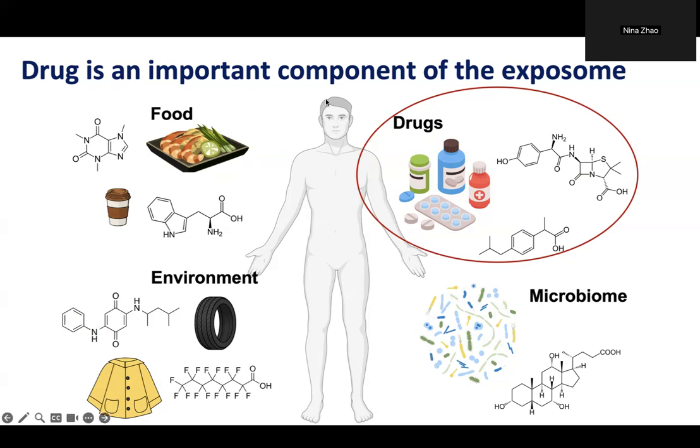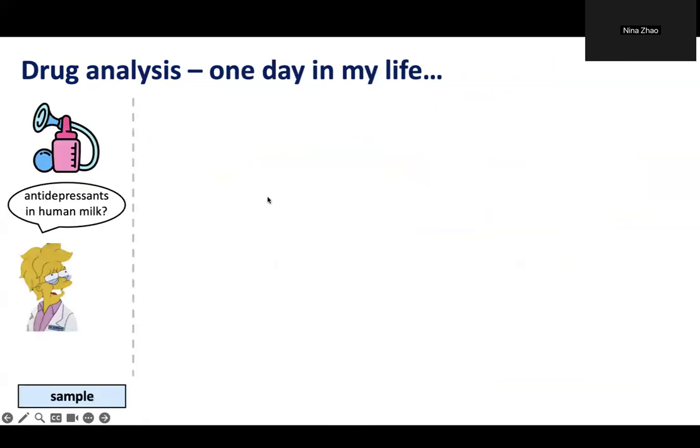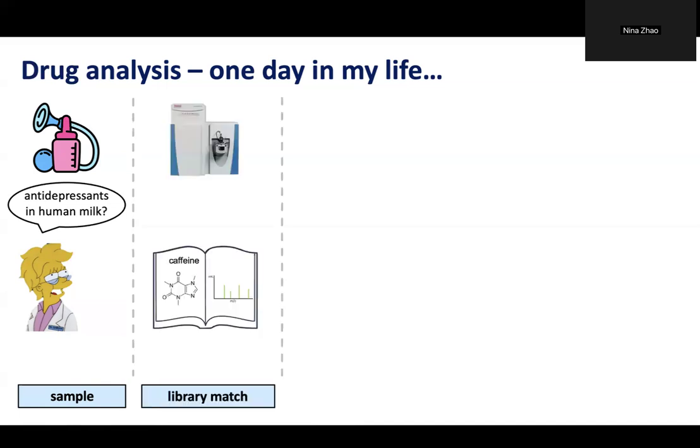Because of this, I actually get a lot of requests about drug analysis in my daily life as a metabolomics scientist. One of my collaborators, of course with high relevance to mPrint, came to me and asked, well, Nina, can you use your magic on untargeted metabolomics and help me to detect all the antidepressants in my milk samples?